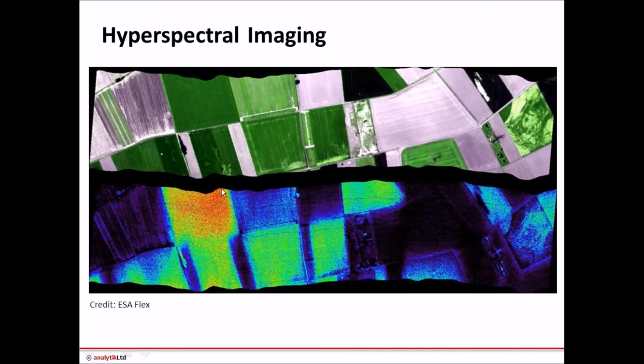And from this data, after processing, we have a decision made, or we can highlight and quantify areas in this image and show exactly where the crops are growing and where there's just bare soil. And depending on how well these crops are growing or how healthy they are, perhaps, we can color code. You can see these false coloration images quite a lot when you're dealing with spectral imaging. Once you've collected the data, you process it and output a false color-coded, false contrast image with a lot of information there to make decisions on.